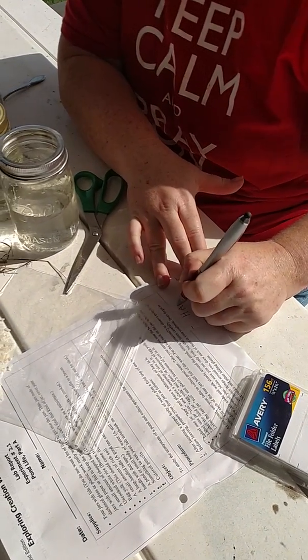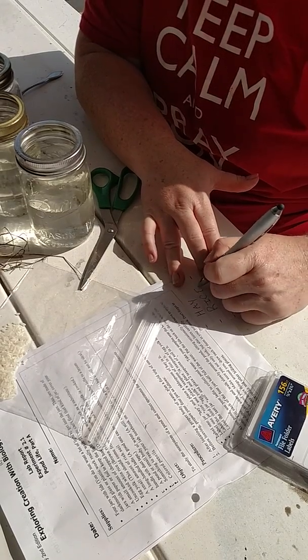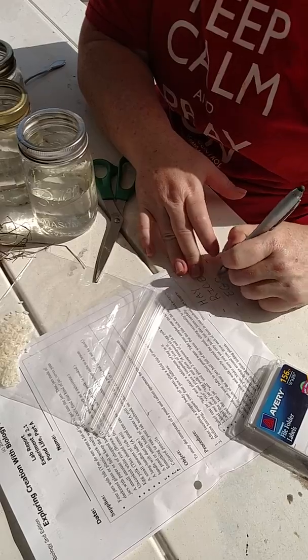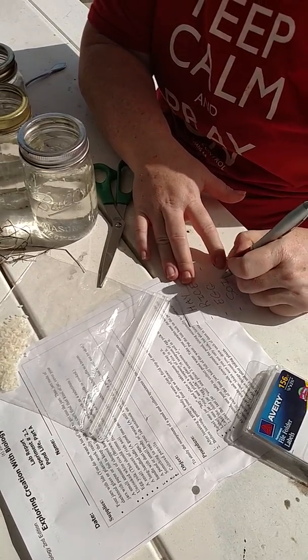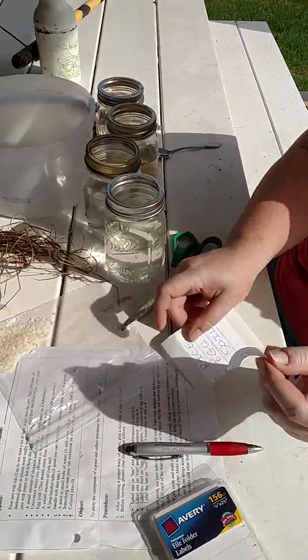You want to label it hay. And then another one, rice. And a third jar, egg yolk — I'll just put egg. And then the last one, soil. So before you actually put anything in it, you want to label the jars. That way you don't get confused.